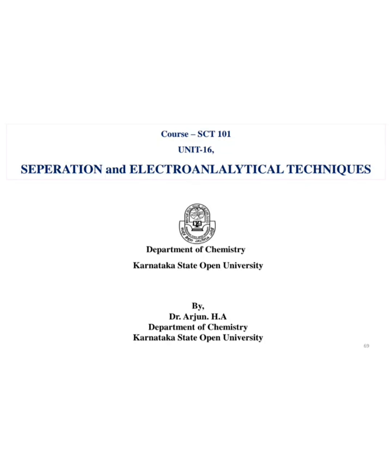Other things, like which detectors we will be using, are not that important compared to the basic thing: you should know the principle of the instrumentation which you are going to write. So today I will be explaining ion exchange chromatography. That is the last unit.